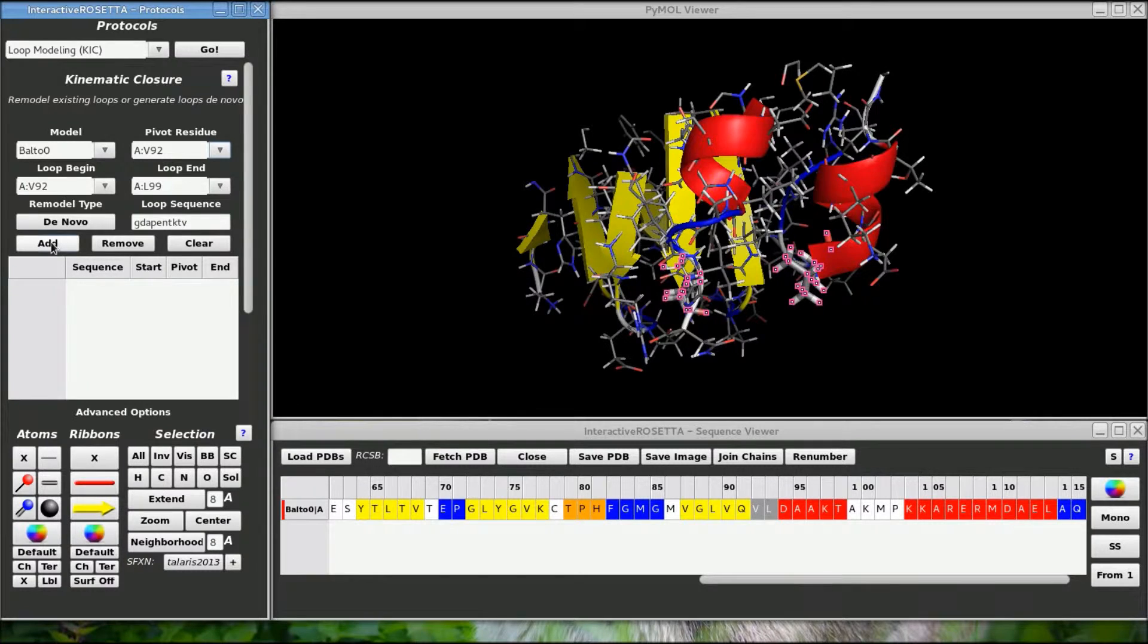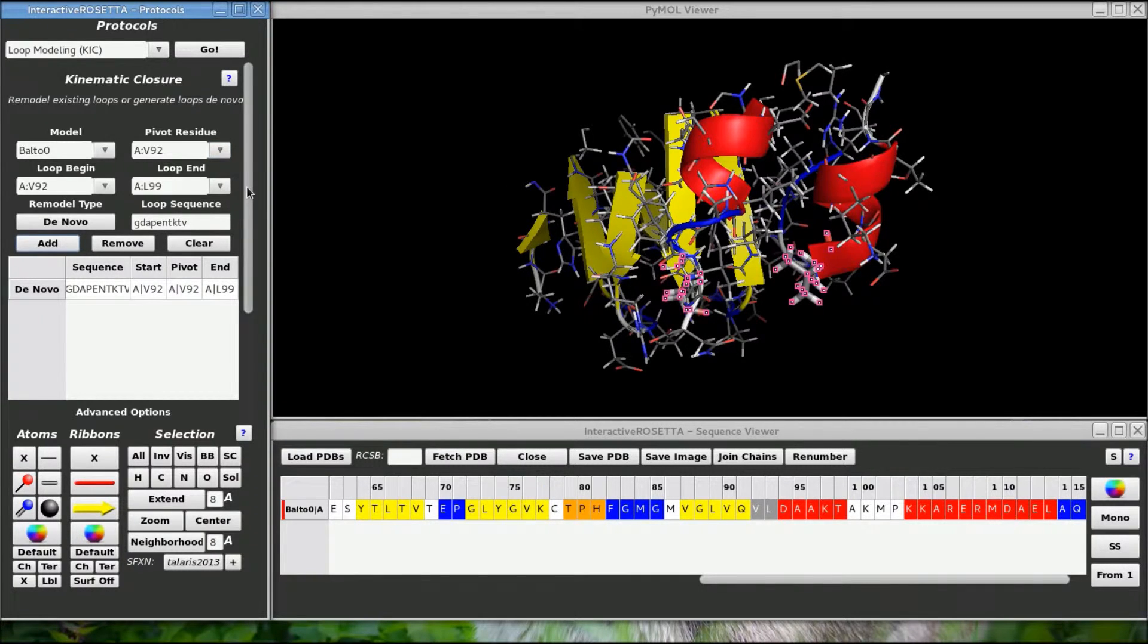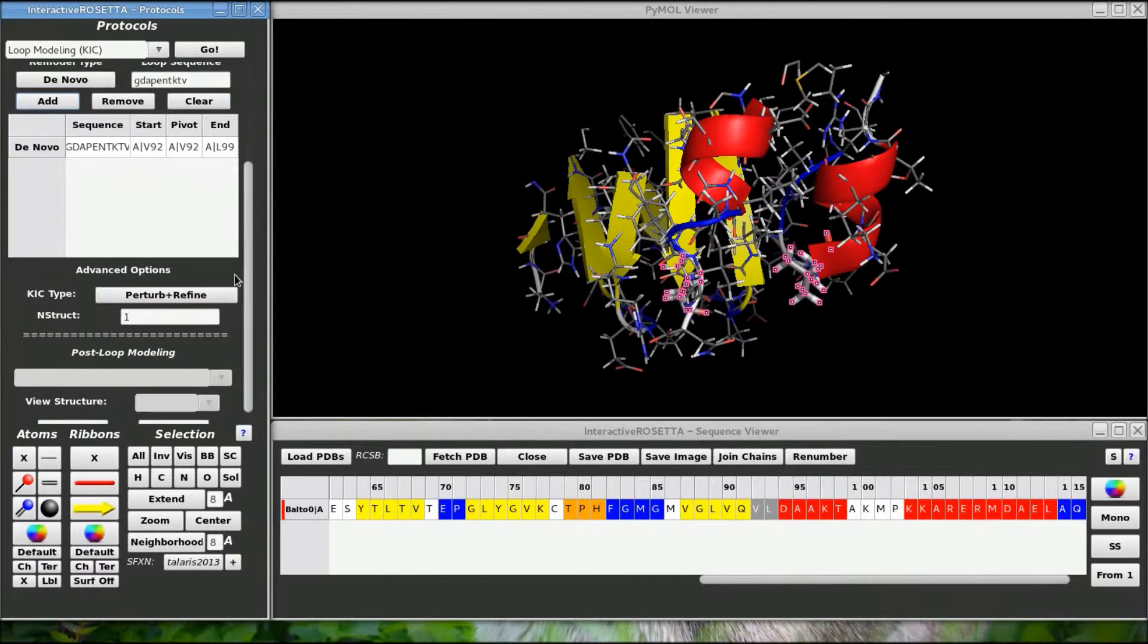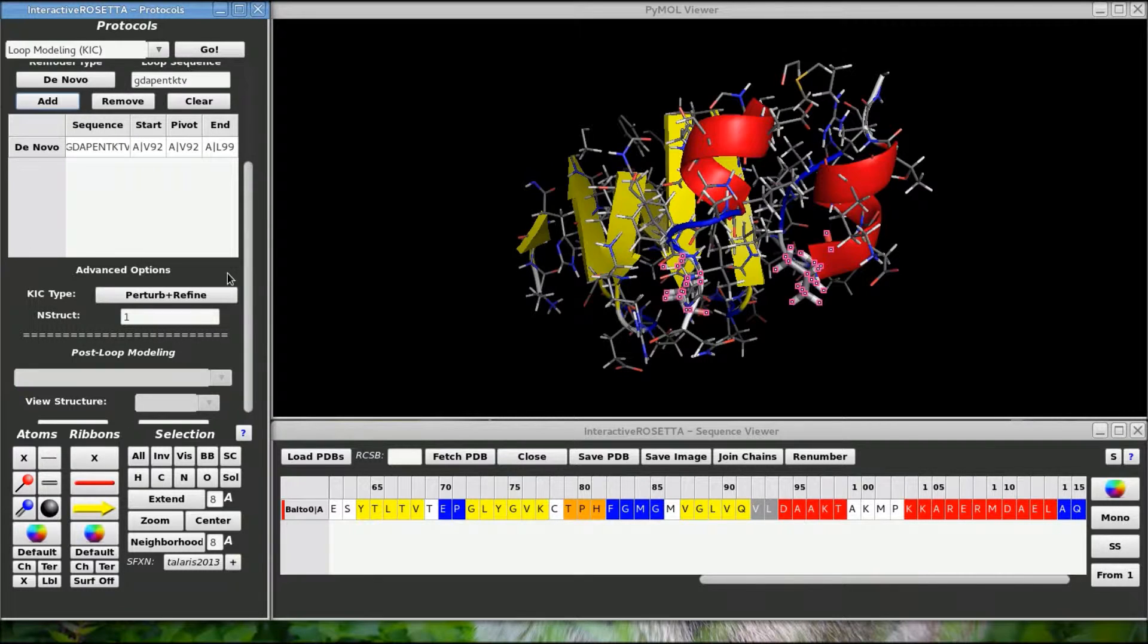Finally, add this loop to your loops file. You can specify more than one loop to remodel at a time, but I am only going to create this loop for now.